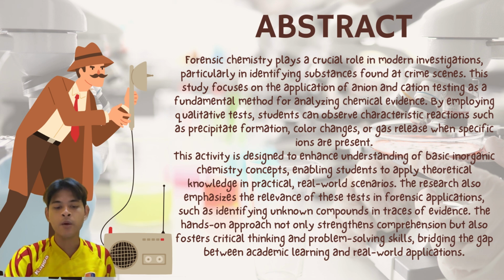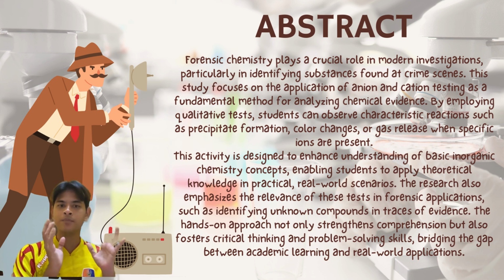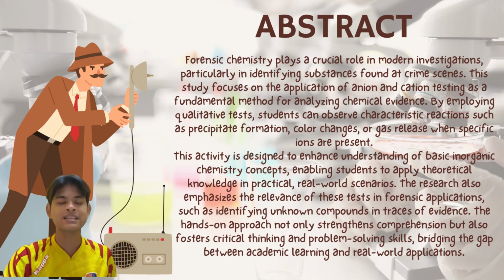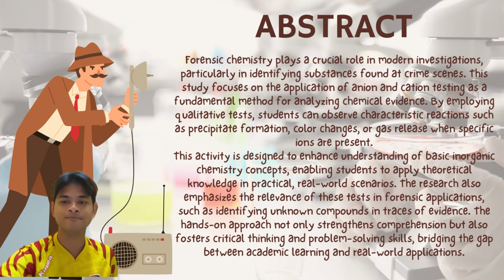So when they have this hands-on approach, they might see and understand more regarding the anion and cation test in forensic and also in the learning.